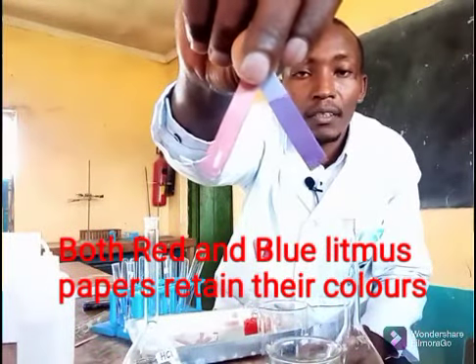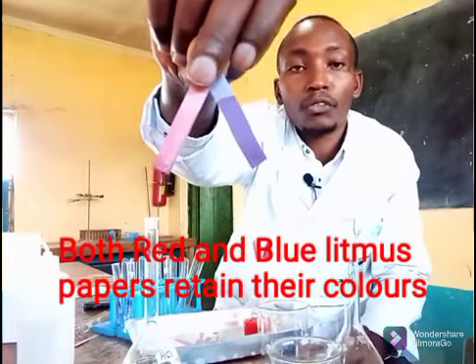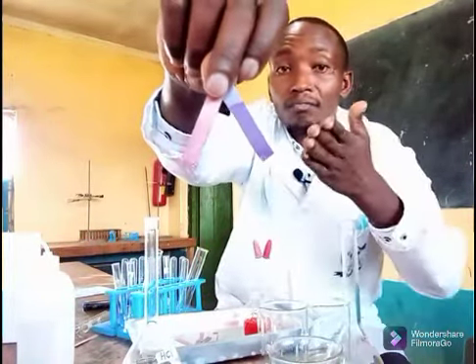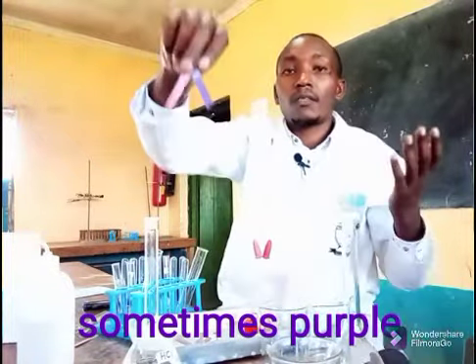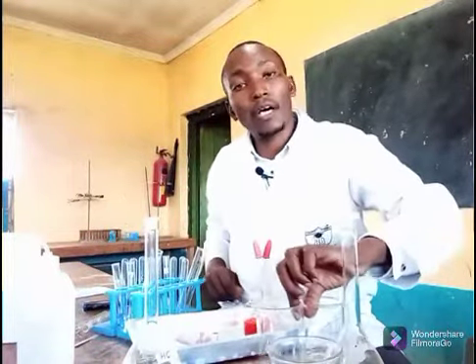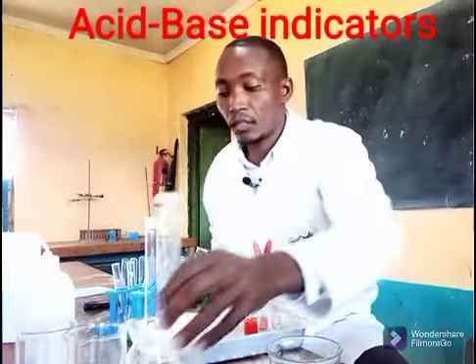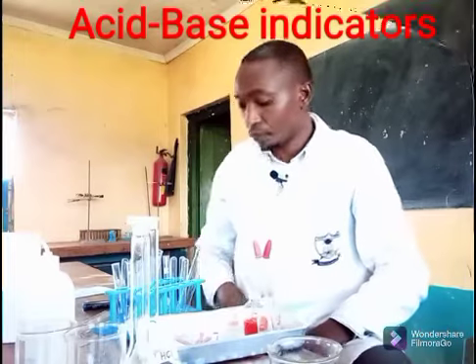The blue litmus paper has remained blue. The red litmus paper has remained red. Although we usually say with the blue litmus paper it will appear more purple, because litmus paper is purple in a neutral substance. But for this case, for now we just say it's blue. That is using the litmus paper.